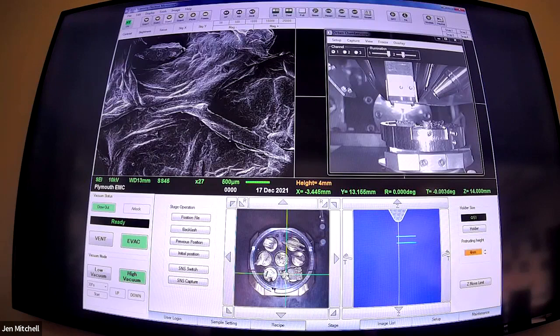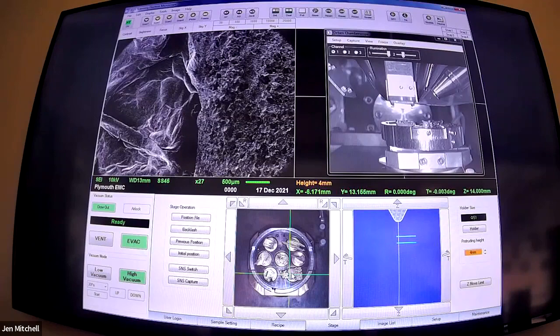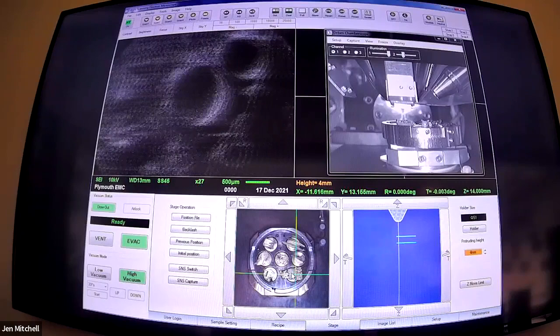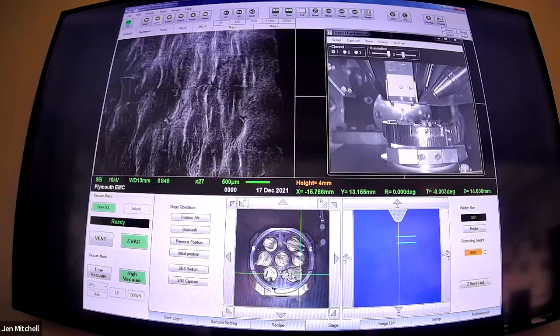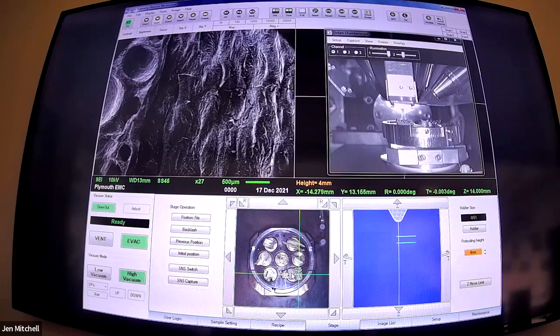If you'd like to hazard a guess as to what this is, feel free. Bear in mind it has had all the water sucked out of it, so it's probably not going to be overly obvious. We'll do a gentle drive across the sample - there are kind of three sections in this one. We've got a smooth bit, another spongy sort of situation, then some holes, and then the outer layer. Kind of smooth and rubbery. It's not a leek - this is a dried orange, part of the mulling spice collection.